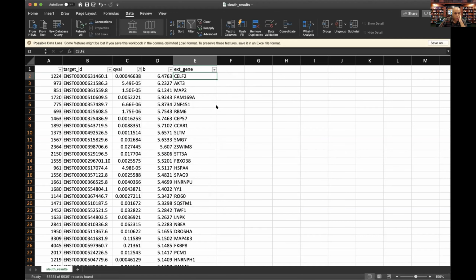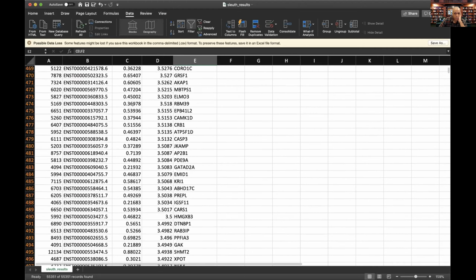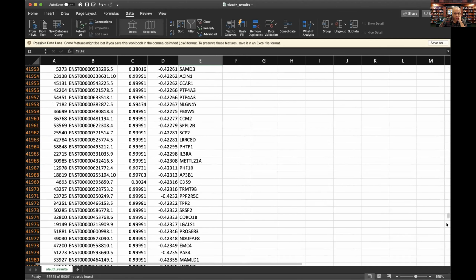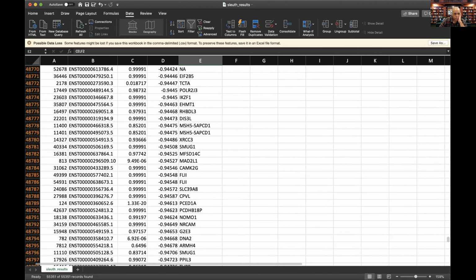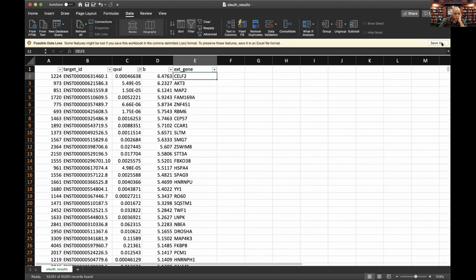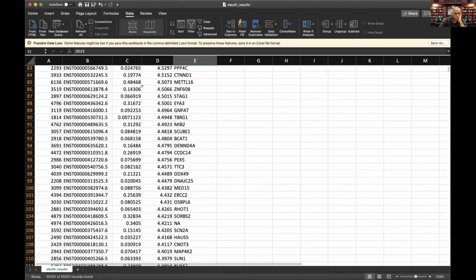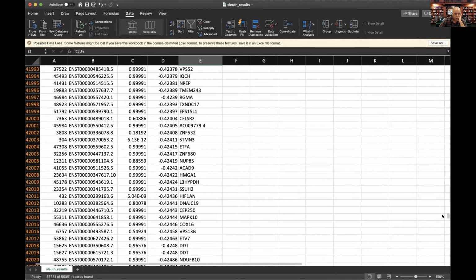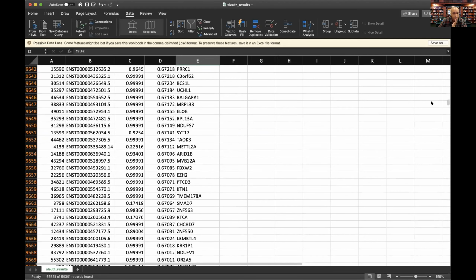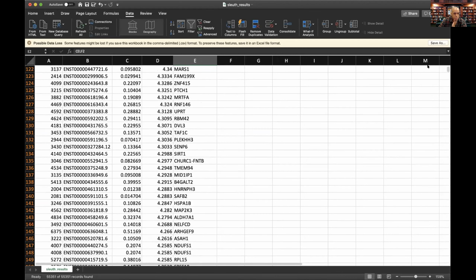All right. So what I've done here is everything that's in this gene list, I didn't care to look, but everything that I've sorted by is giving me these more significant genes. And I don't know that I've really gotten rid of all of them, but I've at least filtered them in a way that I have the top ones on top.